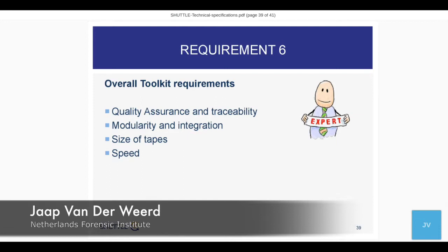If you have a user interface for an algorithm, it should be very nice if you could also upload images that have been acquired with another microscope. If you have a database, it should be very nice if you could also store data that have been acquired with another system. So it would be nice if you could use every tool as a module, and also make it interact with other things that happen in the forensic lab.